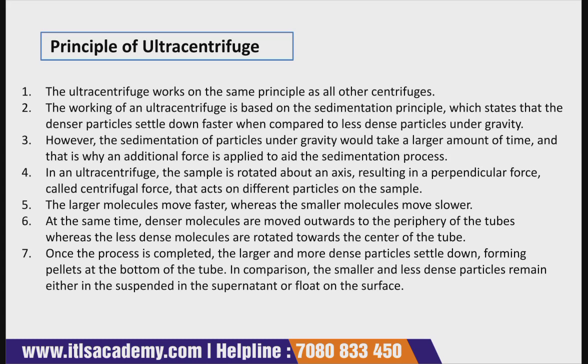So this is the principle of centrifugation. If we see the principle, the denser the particle, or you can say structure, the faster it sediments in the centrifugal field. The more massive the biological particle is, the faster it moves in the centrifugal field.